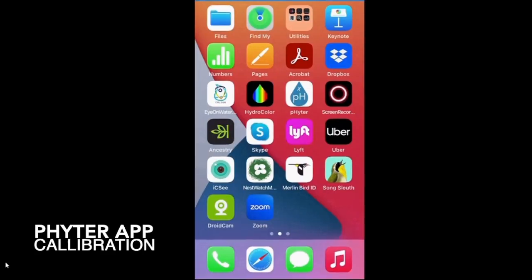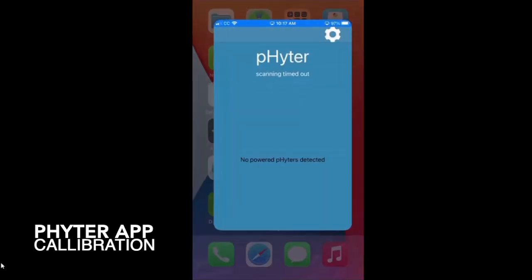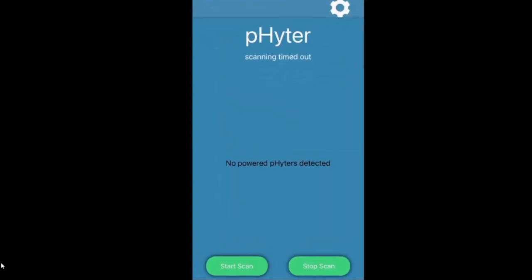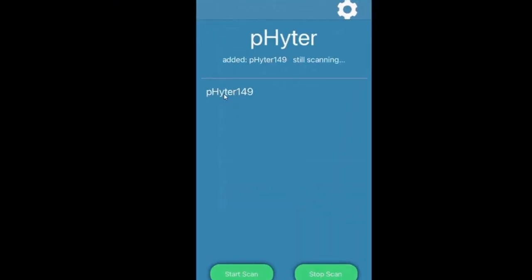Once the Phyta instrument is turned on, click on the Phyta app, start scan, click on the Phyta.